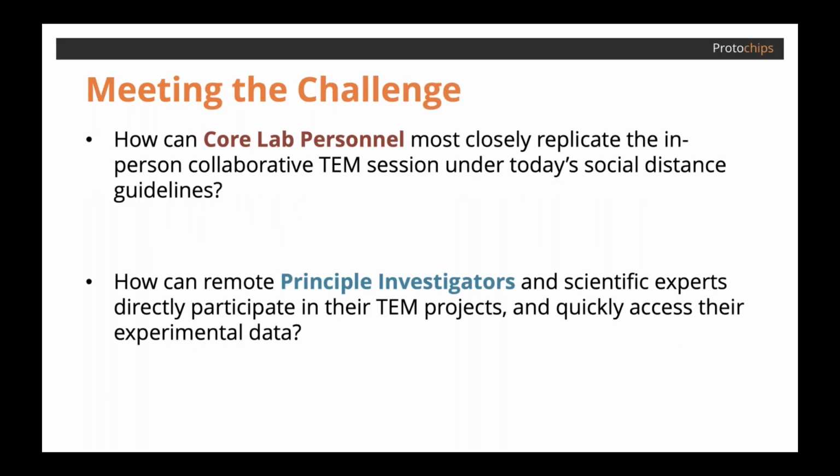So how can core lab personnel most closely replicate this in-person experience and collaborative TEM sessions under today's social distancing guidelines? And how can the scientific experts, principal investigators, participate in their projects and quickly access experimental data? These are the two main questions both sides are posing at this point.